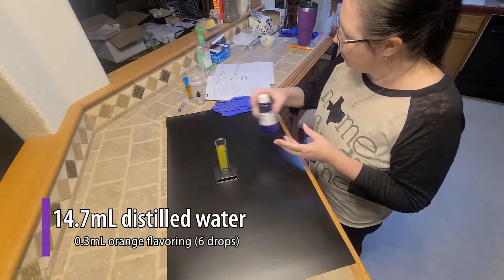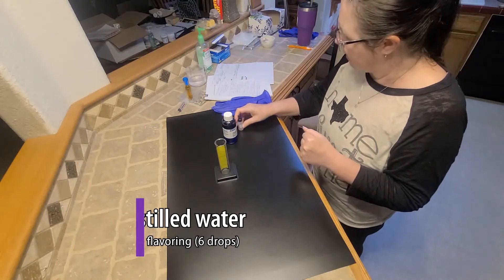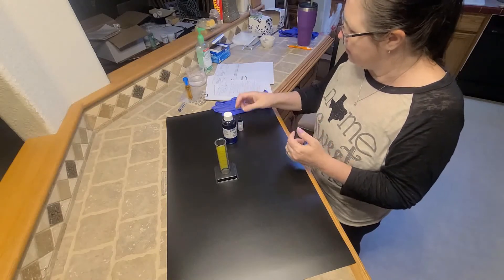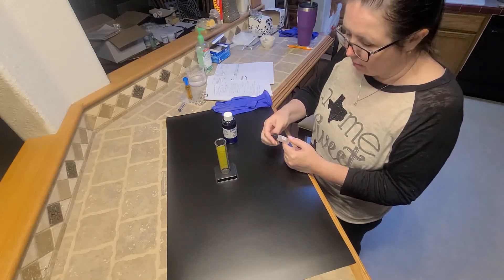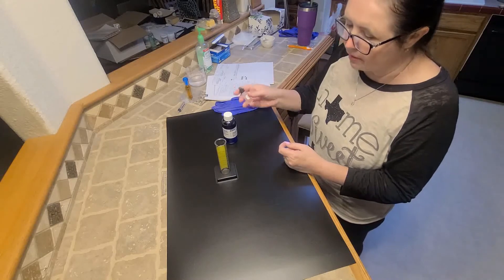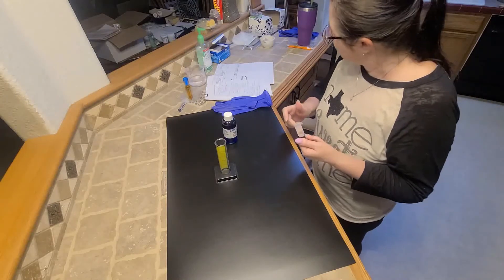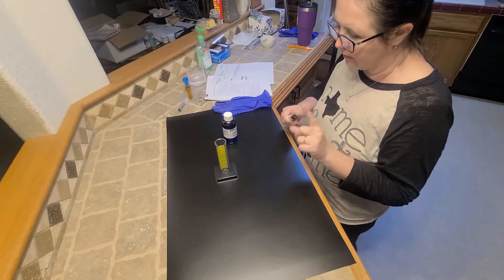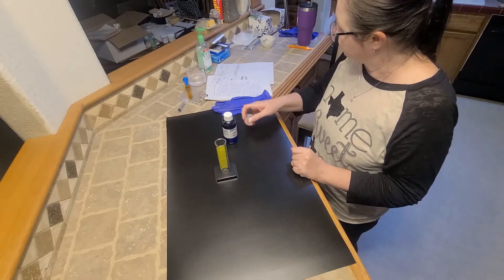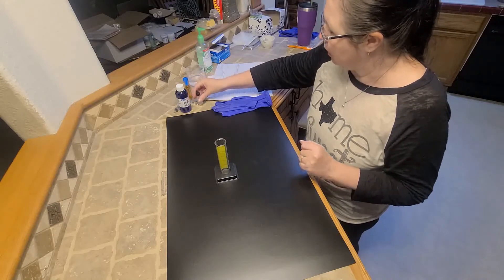We are going to be using distilled water added to our powder, and we are also using orange flavoring drops. The water we are adding is 15 milliliters, but because we are adding drops — 0.3 milliliter drops, which is six drops — we're going to subtract that from the 15, making it 14.7 milliliters of distilled water and 0.3 milliliters of orange flavoring. Now I am going to wash my hands and then we will begin.